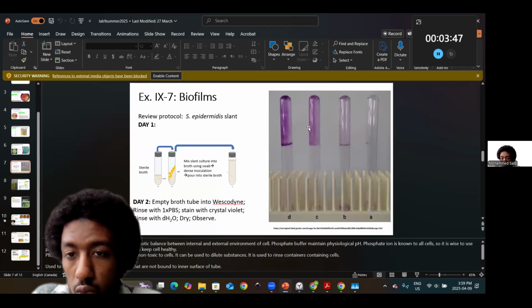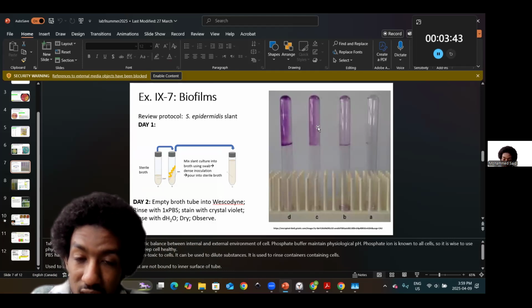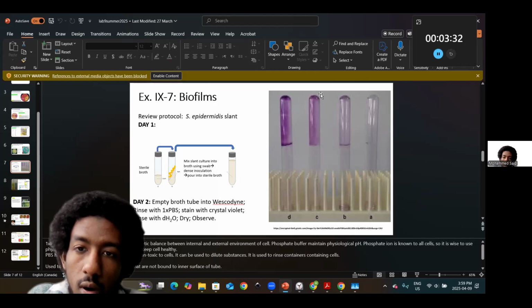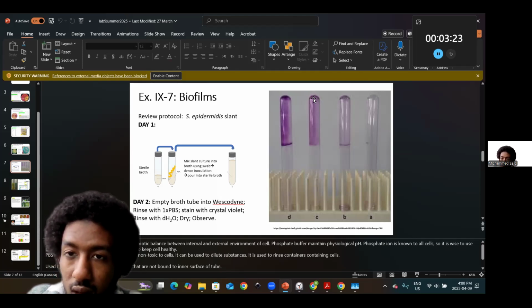Let's say you wash too rigorously, let's say you pelleted and a lot of the bacteria seeped through, including the pellet, or another extension in this case where you have these intermediate colors, as I just hinted before. What if you had UV exposure or high temps, right? And that in turn could also influence the maintenance of your biofilm.